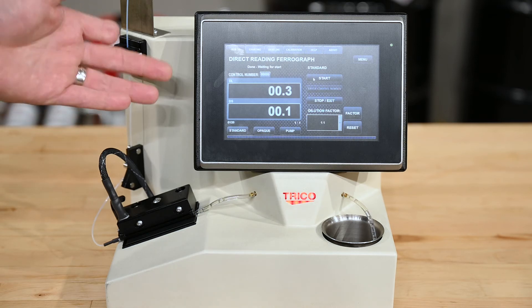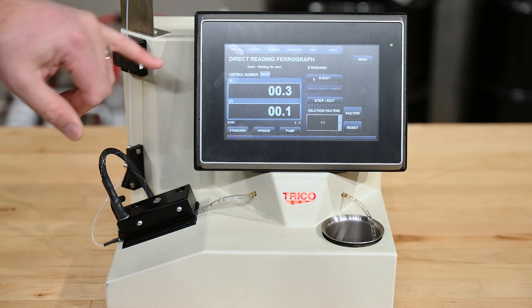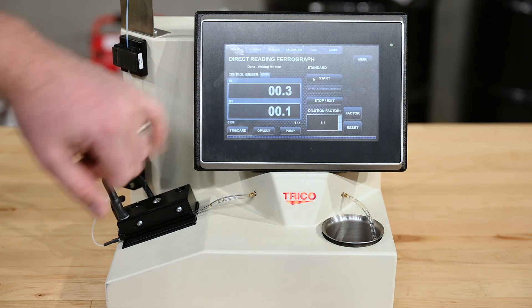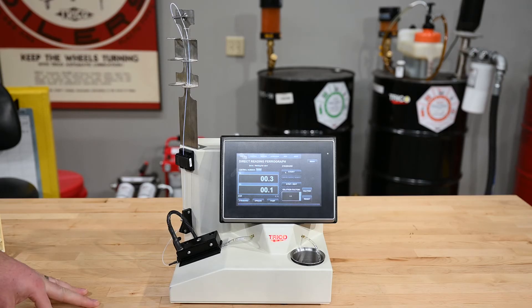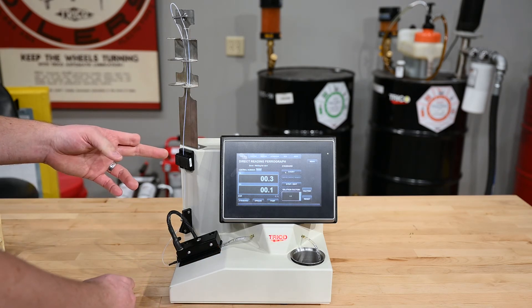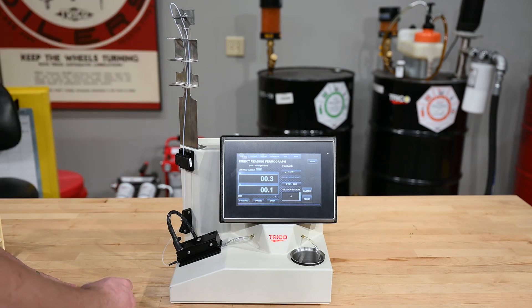Now the unit is complete — it says done, waiting for start for the next oil sample. You can see we had a very clean fluid with a low DL and a very low DS. Now that the unit has finished running a sample, we remove the precipitator tube from the optics block and the end of oil sensor and throw it away, as well as the sample vial. We do not want to reuse the precipitator tubes or the sample vial because of cross-contamination.